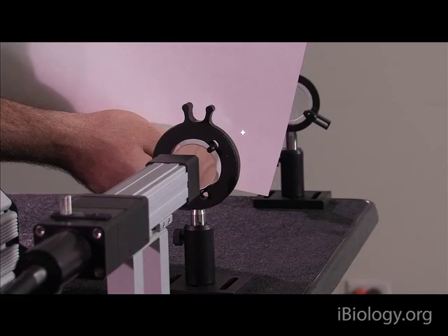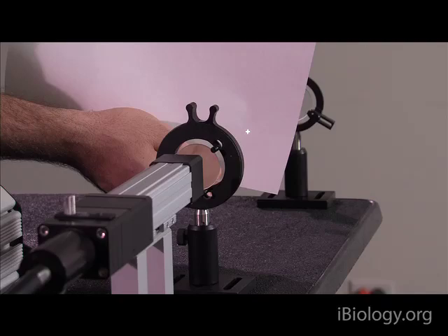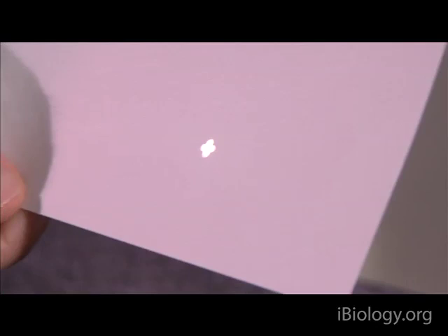And it's interesting to note how uniformly illuminated this is. You wouldn't know if you looked at that intensity that this is a cross or rays from a cross. It's only at the position of best focus where you see the cross.